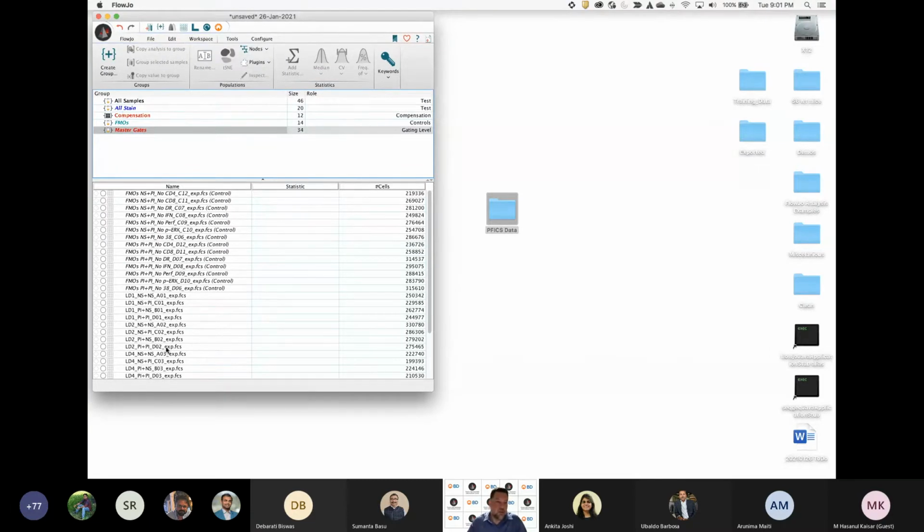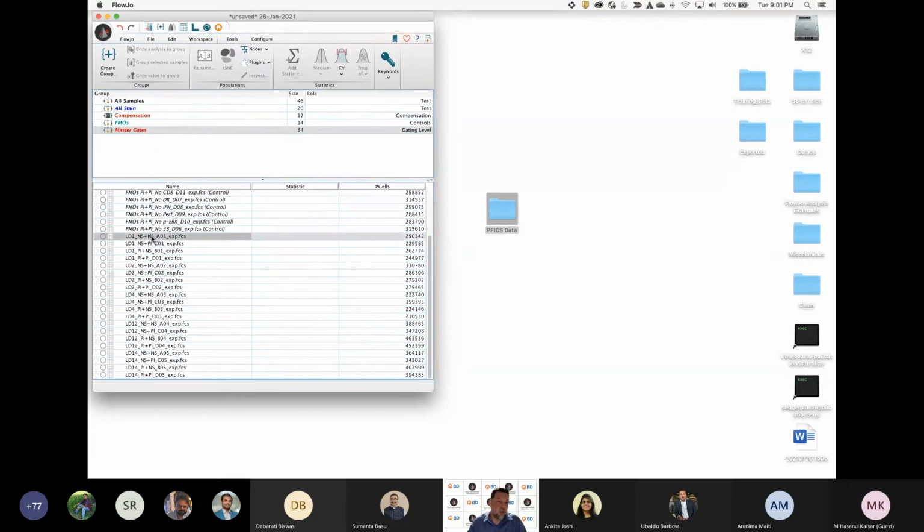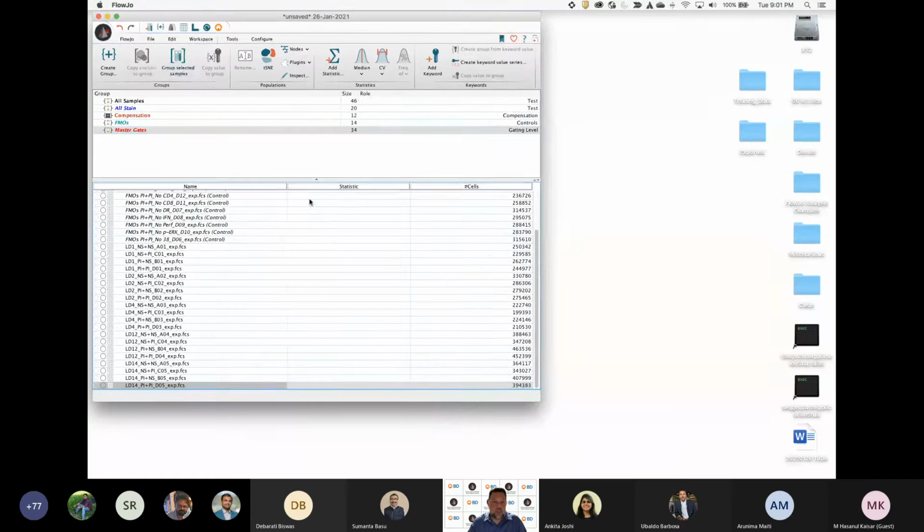I want to go down here and I might want to organize my samples further. Maybe you only have specimen 1 through specimen 20, right, shown as your names. Well, you can always add keywords to describe your samples as individual columns. And as I mentioned, I like to add keyword information on the instrument. So there's a way you can do that, similar to adding the labels for your antigens that are targeted by each color, representing each of your different channels. You can do that on the instrument.